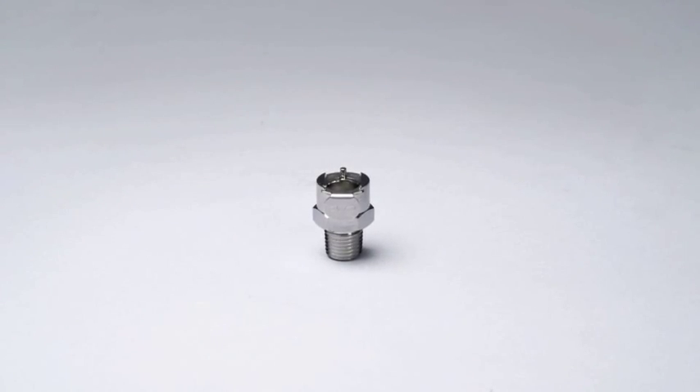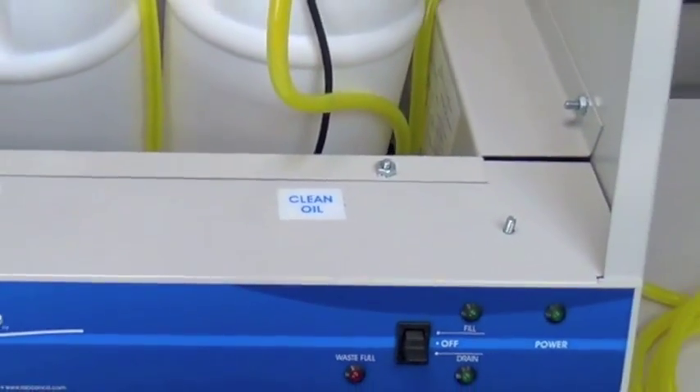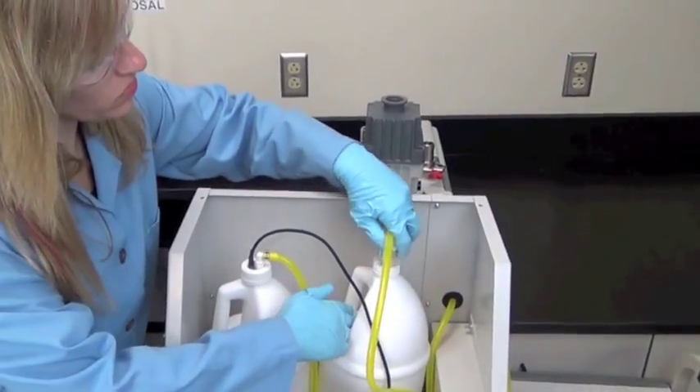The coupling supplied has a male one-quarter NPT connector. Contact Lab Conco for an adapter if your pump does not have this kind of connection. To check if the clean oil container has fresh oil, unscrew the cap and pull the tube assembly out.